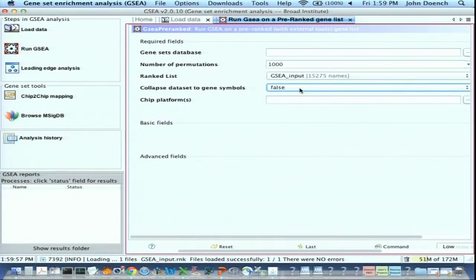You do not want GSEA collapsing your hairpins to genes. It will do it in a random way, not having anything to do with your score. You can run the program and you'll get a result, but it will not have been done based at all on the score of your shRNA. It will have just randomly picked a particular hairpin to represent a gene and go from there. So true shouldn't even be an option in this particular menu. You absolutely want it to be false. Chip platforms.